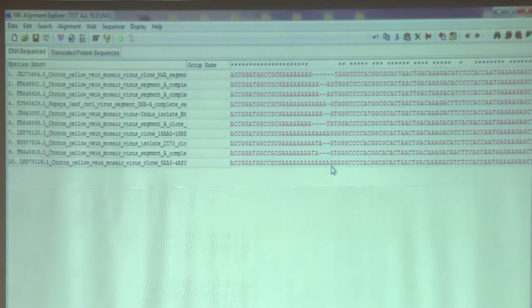First, you should remove all the vector sequence and all the unnecessary sequence, and trim your sequences so that all of them have a similar length. Otherwise, these gaps will be bigger, and you will not have a proper sequence alignment and proper phylogenetic tree. Similar length also means the first base of all your entries should represent the same sequence coordinate.